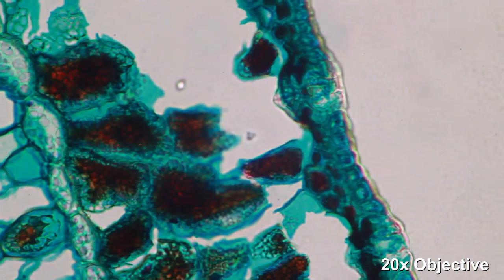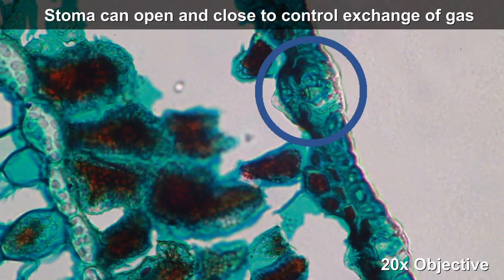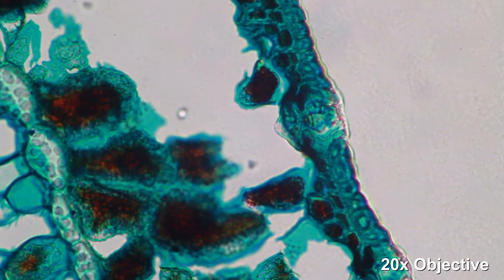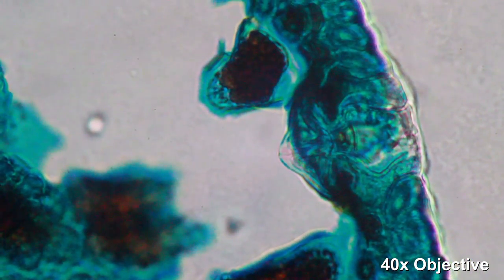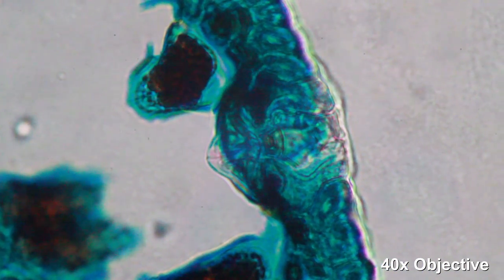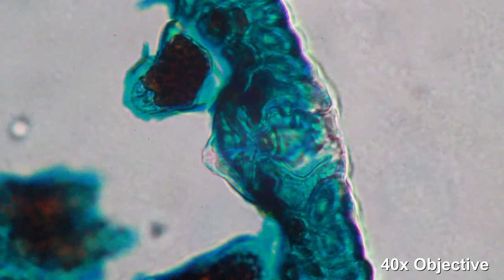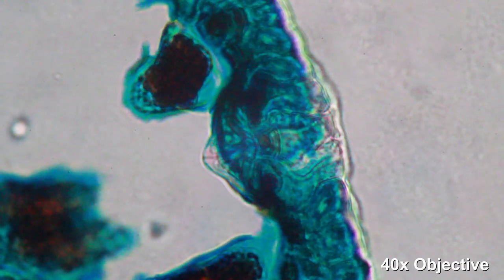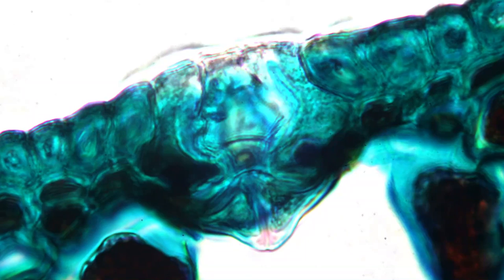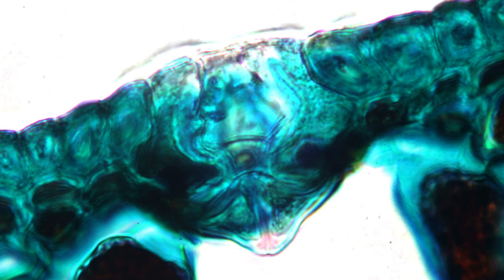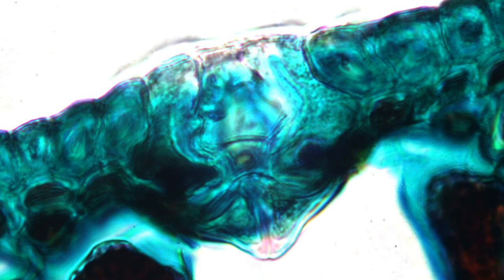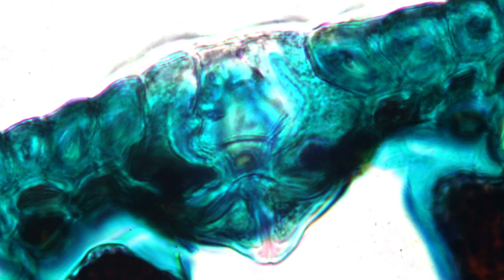Again, there is the epidermis here, and what we see is a so-called stoma. These are small openings in the epidermis which allow for gases to go into and out of the leaf. The stoma can also open and close, and this way they control the water loss. Here we have a nice close-up. When it's closed, less water can be lost over the leaf.